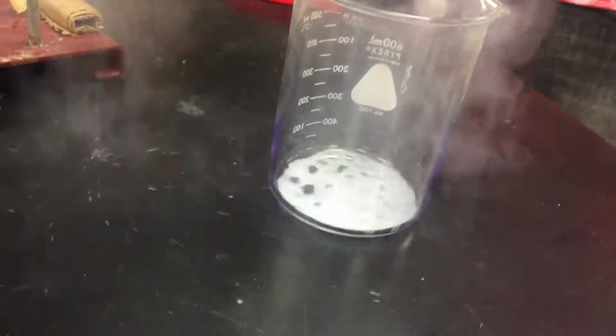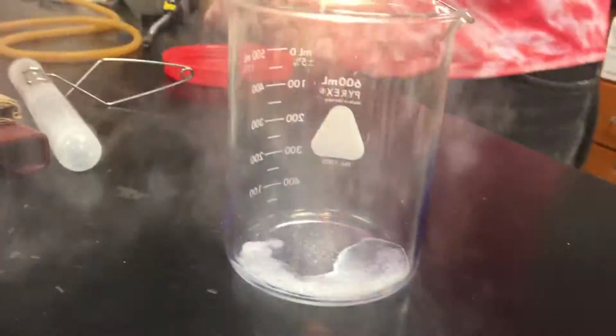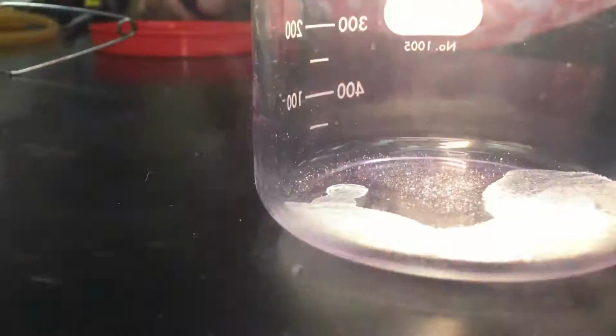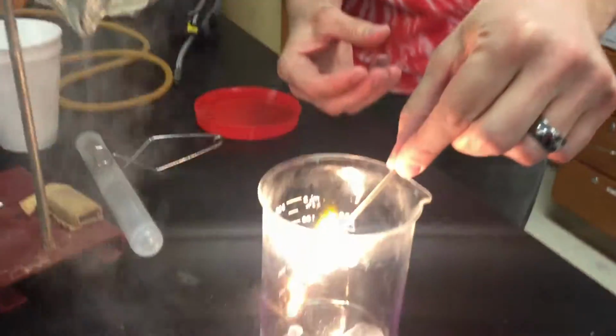Now I'm going to show you that that is in fact liquid oxygen because I'm going to take this little wooden splint. I'm going to light it on fire. And when I put it in there, you see how much stronger the flame becomes? Why? Because there's oxygen in there. More oxygen in here than there was in the air.